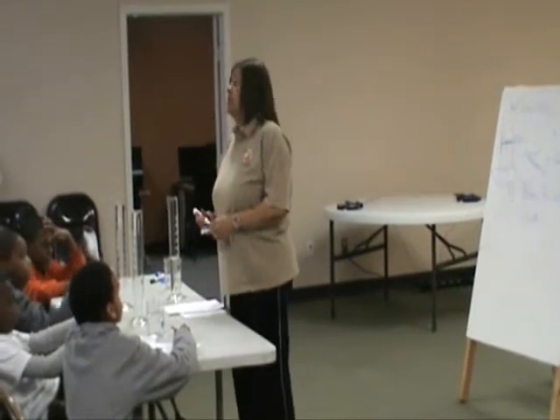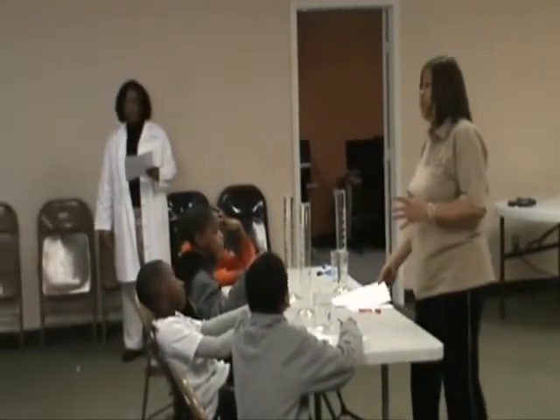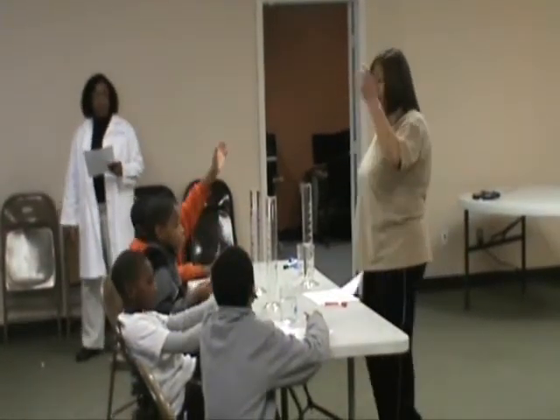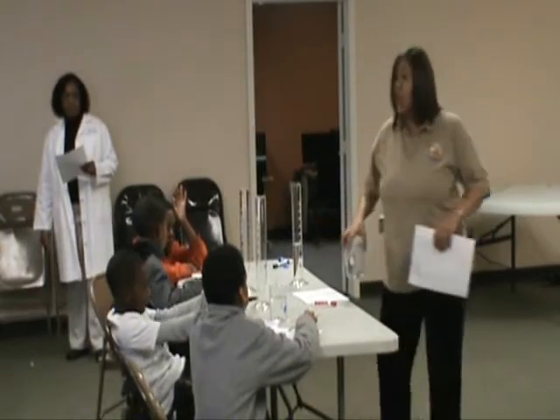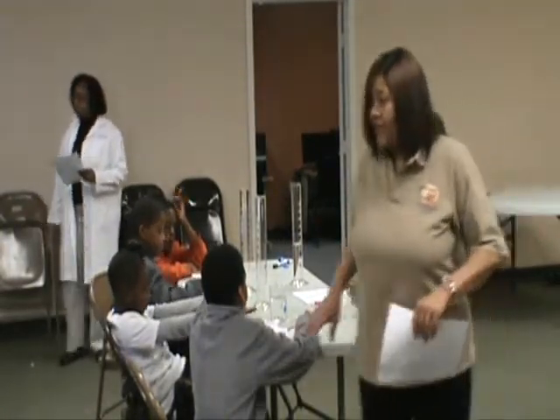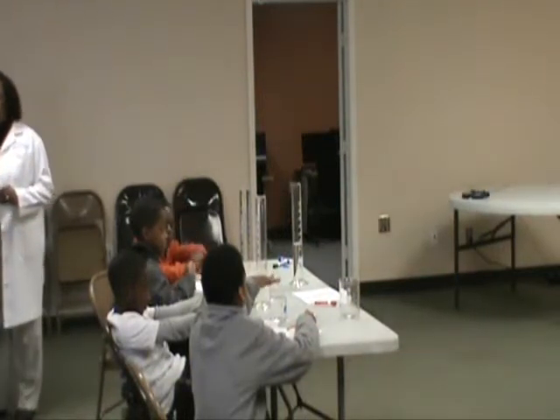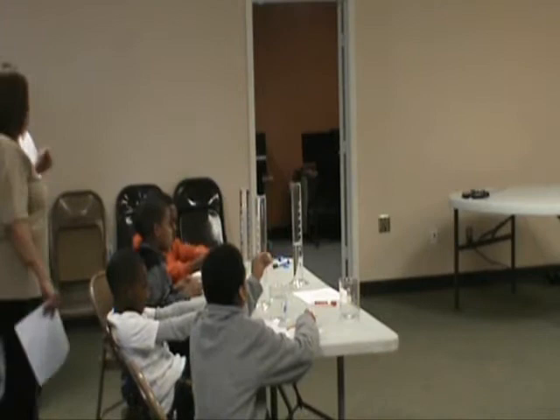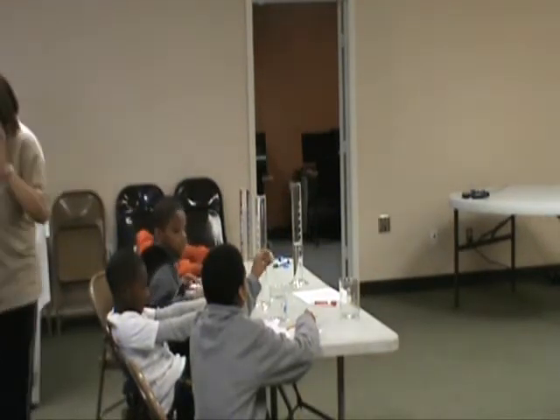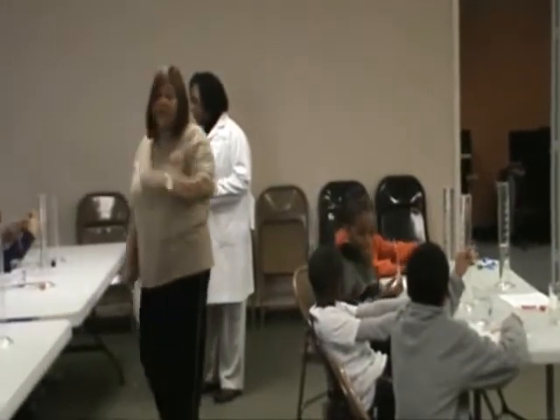So first we want to start now and fill our graduated cylinders. Now, before all of you just got here, in front of you we have a beaker that should be half filled with water. Check right now to make sure everything is in front of you. And then after that, you're going to take your pipettes out for now. Squeeze the air from your pipettes. Squeeze all the liquid out, and take them out of your beaker.